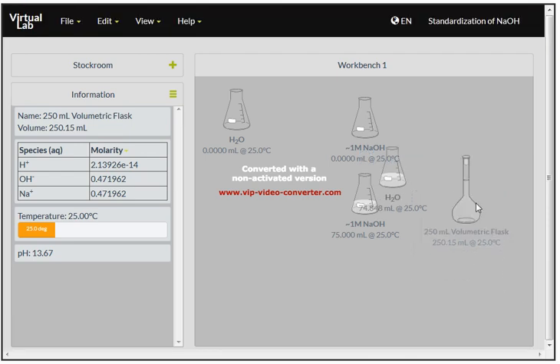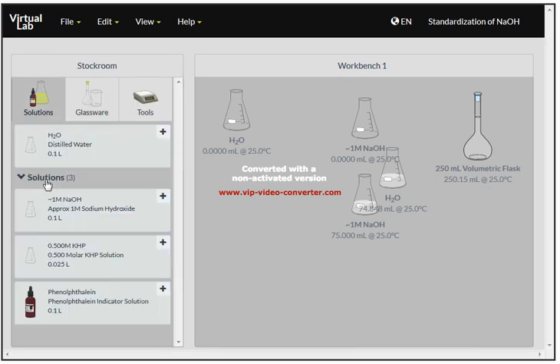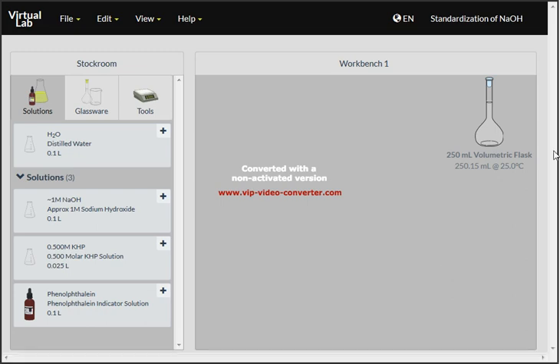Now you have prepared your dilute sodium hydroxide solution, which you will then standardize with the potassium hydrogen phthalate. With your sodium hydroxide solution prepared, you can now standardize this using a pre-standardized solution of potassium hydrogen phthalate, or KHP, which is already known to 3 significant figures.